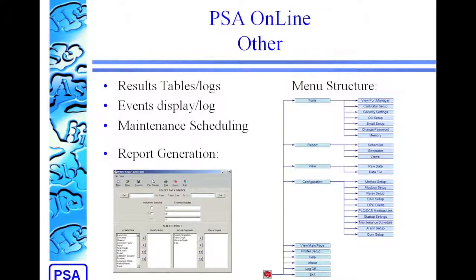The software also has a wide range of other features available within it for results reporting, both via external links and from pulling off DDE files or printouts. There are also event displays where we can see the alarm history and currently active alarms, maintenance scheduling, and a wide range of other setup tools that are only really encountered to any great extent during the initial setup.